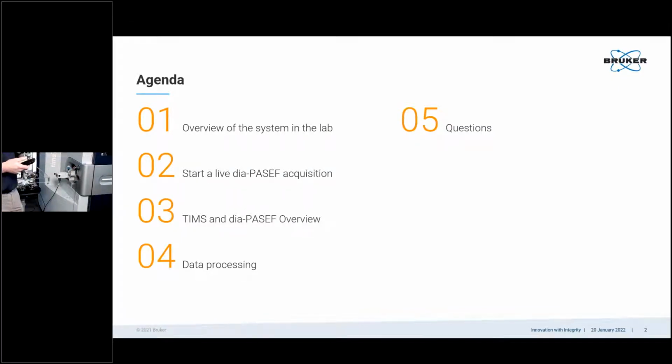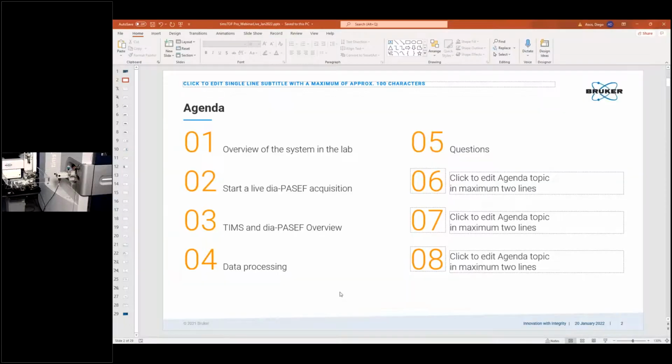Okay, so as I said, we can come back to that in a little bit just to discuss some more specifics there, which might be interesting. But maybe now we can actually just jump to the actual software itself, and we can actually set up an acquisition, and I can take you through that process.